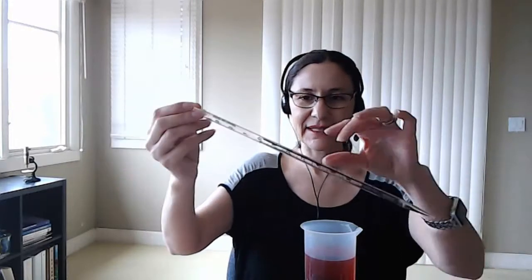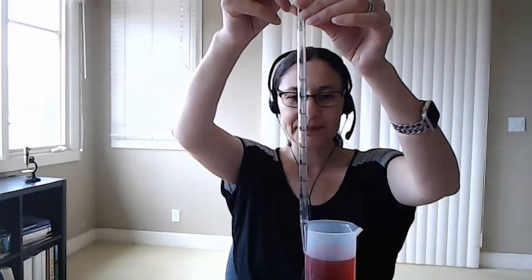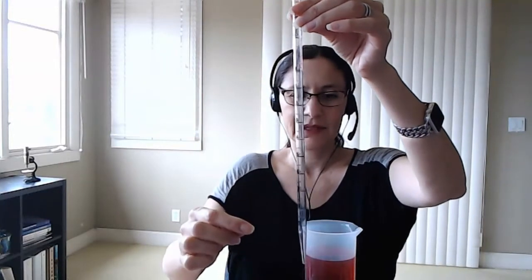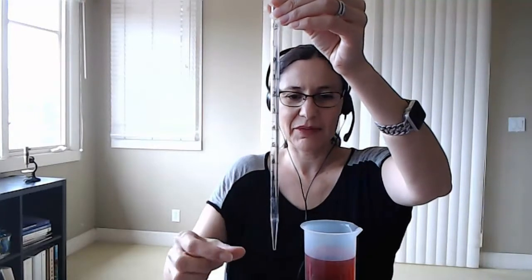So I'm going to take out my pipette from its sleeve, and I want you to notice that there are graduations on this pipette. In larger markings, this is a total of a 10 ml pipette.